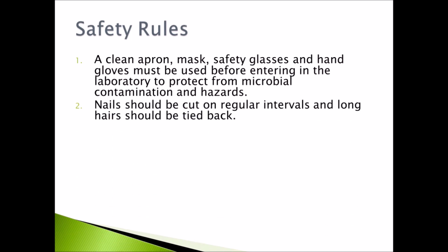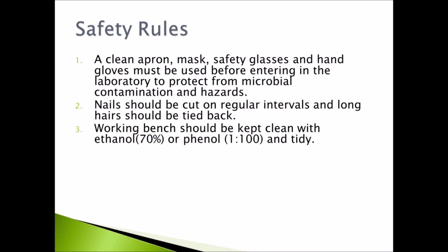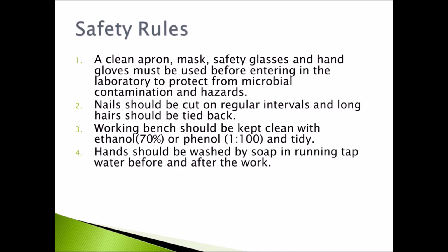Number two, nails should be cut at regular intervals and long hair should be tied back. Number three, the working bench should be kept clean with ethanol 70% or phenol 1 in 100 and tidy. Number four, hands should be washed with soap in running tap water before and after the work.